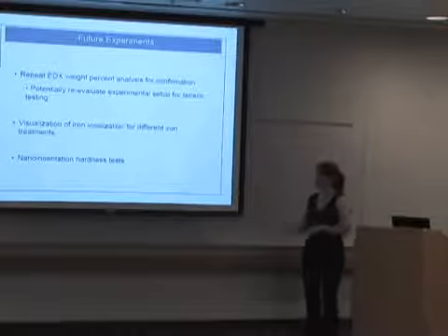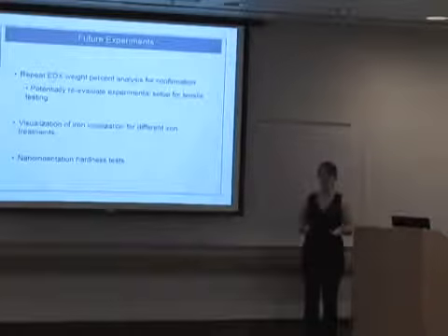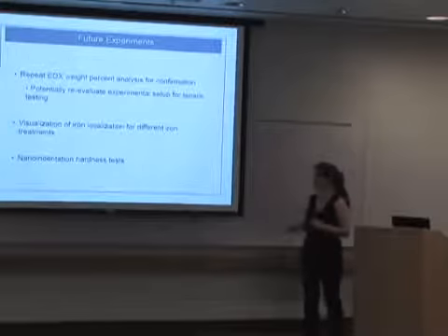Eventually, I hope to move on to the visualization of the iron localization to see where it's going in the threads, and potentially more detailed mechanical tests such as nanoindentation may provide me with a more controllable mechanical test of certain spots on the threads.